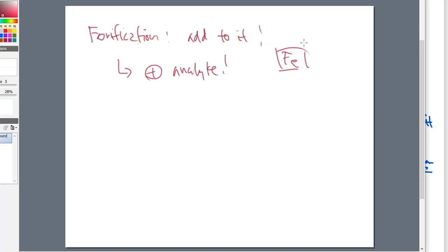I'm going to take a certain amount of iron and add it to these solutions. This is something that I'm looking for, and something that I'm doing, so I should know what the result is going to be. Meaning, the first definition here is a laboratory fortified blank.